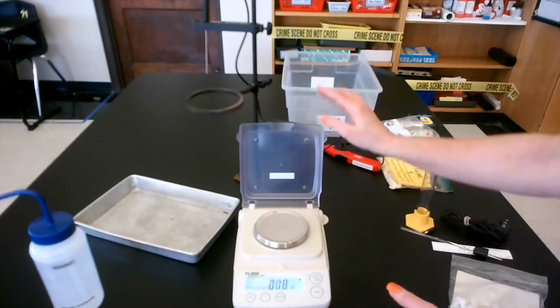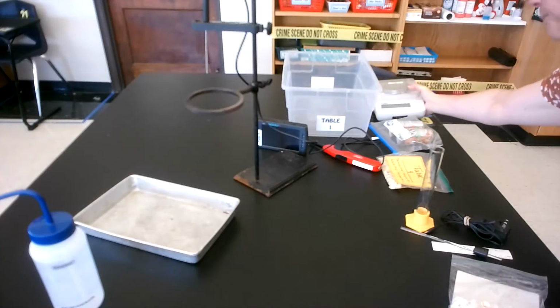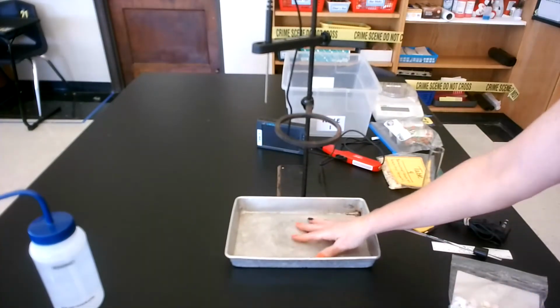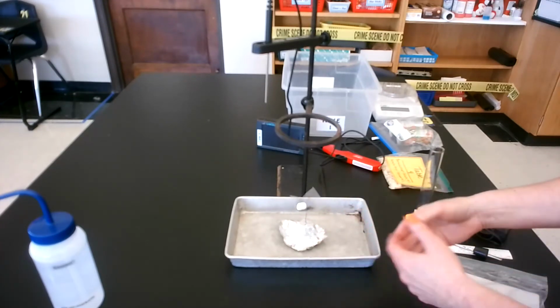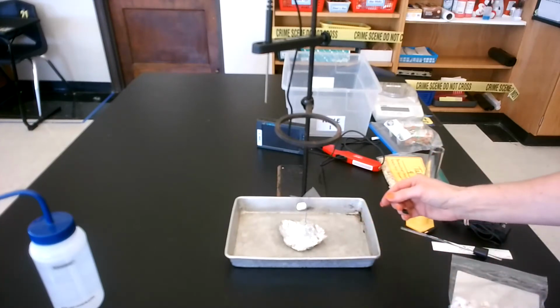So once I find this mass, I can go ahead and get my balance out of the way. I'm going to turn this off. So you have to hold it. There we go. And now I'm going to start constructing. Like I said, I'm going to build from the table up. So here's my tray. I'm going to put my food holder in my tray. That way if anything falls or whatever, I can catch it. Okay? It's not going to be a lot of flames going on here.